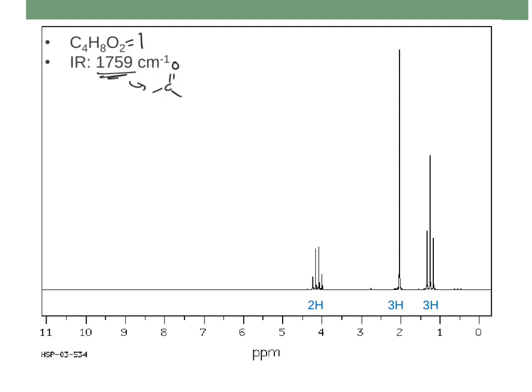Here it is. There's a few things this could be, but I'm going to take a look at my NMR and make some pieces here. So let's first start with this piece, this 2H peak right here. This is saying it's a 2H peak, so I'm going to draw 2 hydrogens here, because it says it's 2H. Now it's also a quartet, and that means that I have 3 neighbors. So next to it, I'm going to draw 3 neighbors.